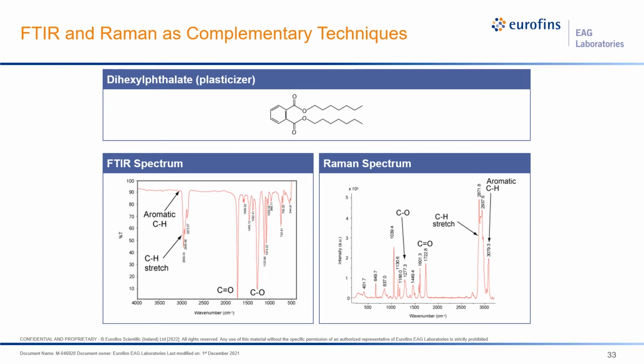With FTIR, we typically show data in percent transmission mode. Here we have wave numbers, and the wave numbers are in decreasing order. Now with Raman, it's the opposite, a different convention. Here the numbers are in increasing order, and our units are intensity units. So a little bit different, but one thing you can see is a similar kind of pattern, right? Just almost like a pattern flipped upside down.